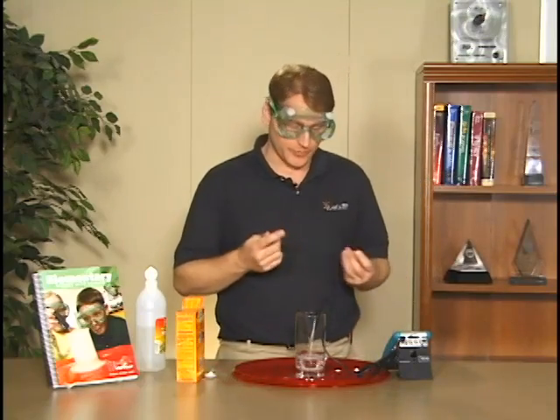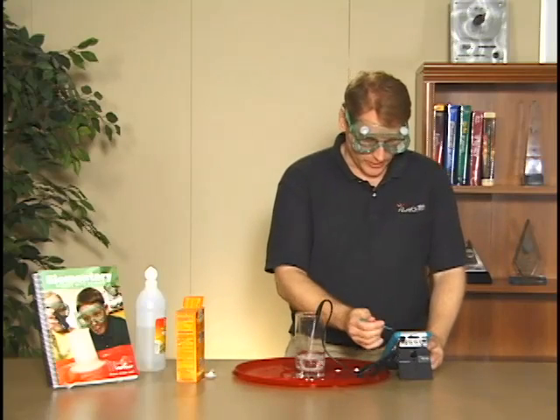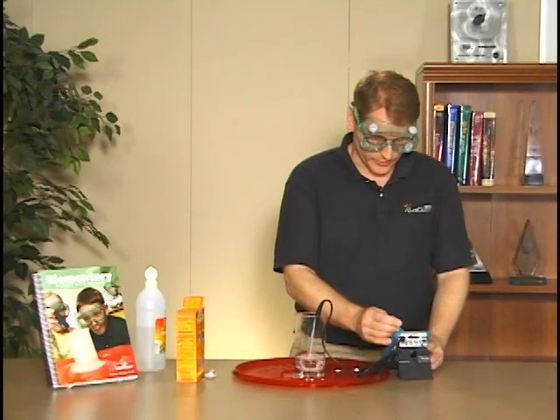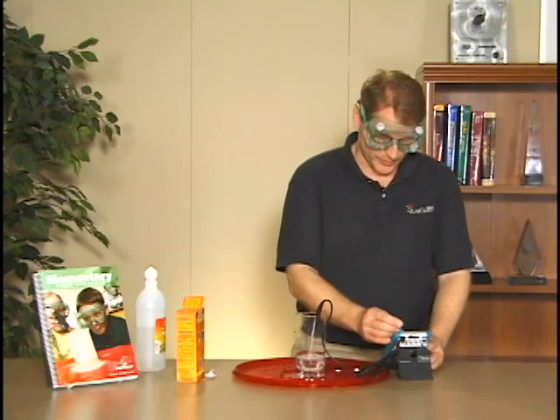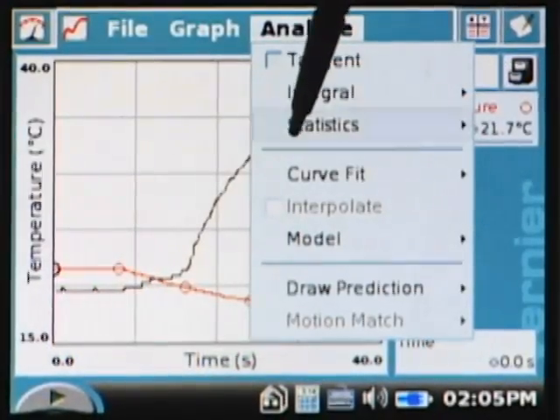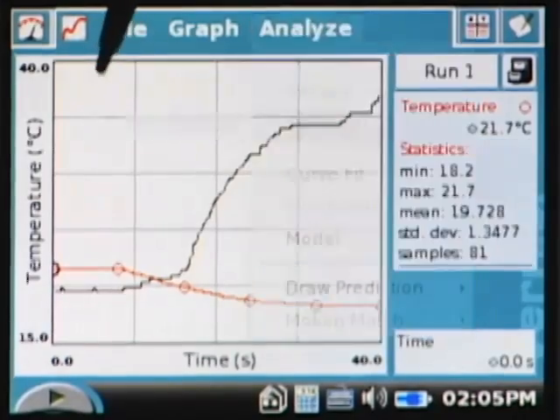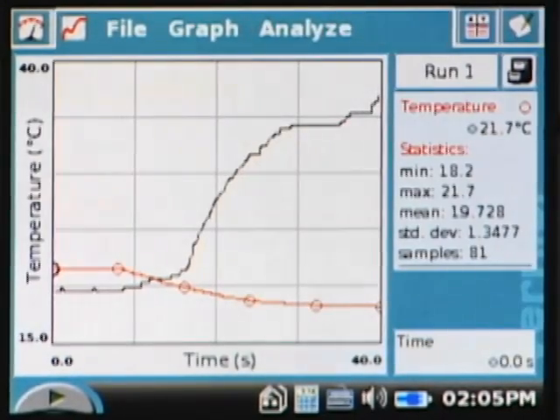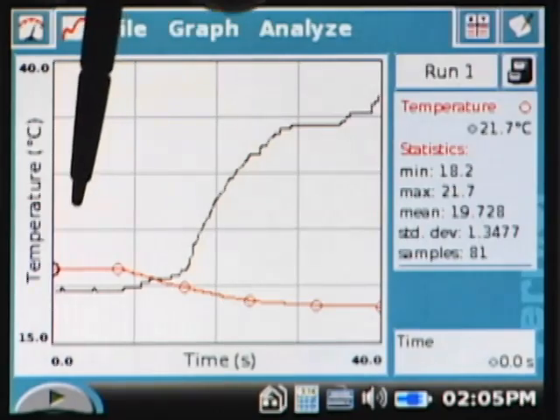I can do some statistics - I'm going to go to analyze, and we go to statistics. Over on the right side of the screen, we see the minimum temperature was 18.2, the maximum was 21.7, and we can see that there. We can even move along our graph and actually find the values at different points in time if we want to.